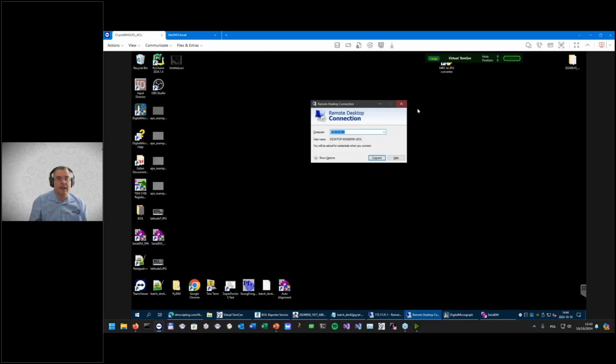client. We talk here about Windows systems. If your support PC runs on a Mac or on Linux, then basically you will need to have the IP address of your JEOL computer, and you will have to provide the username, often in the same way as you can see it written here, so domain/username. But this information should be provided by the local IT support.